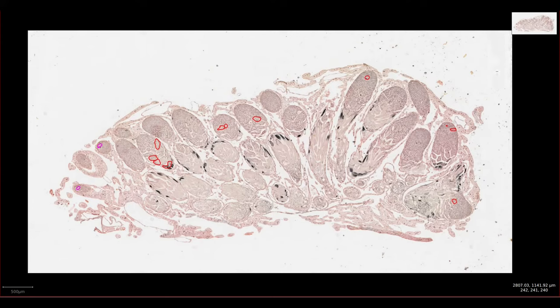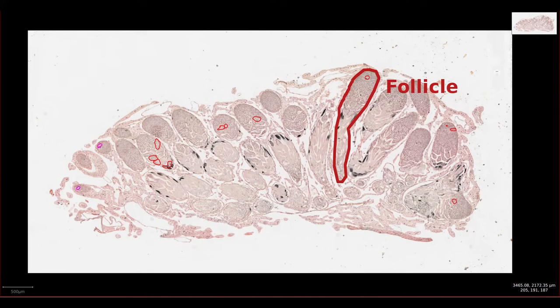Invertebrates also have testicles which produce sperm as a means of transferring genetic material for reproduction. Just looking at the slide at low power we can start to see some kind of structure to the organ. There are various linear lobules of tissue with a cellular tip and then a layer of streaky black followed by a less cellular base. Each of these lobules is called a testis follicle and the sperm's journey begins at the tip in an area called the germarium.